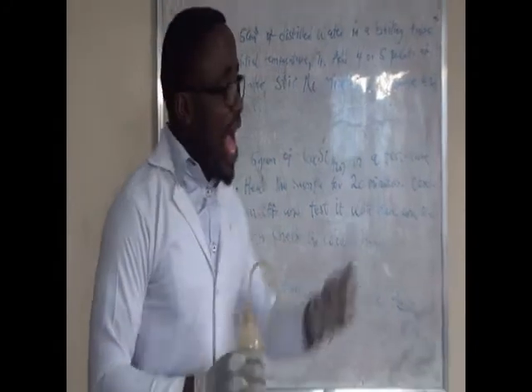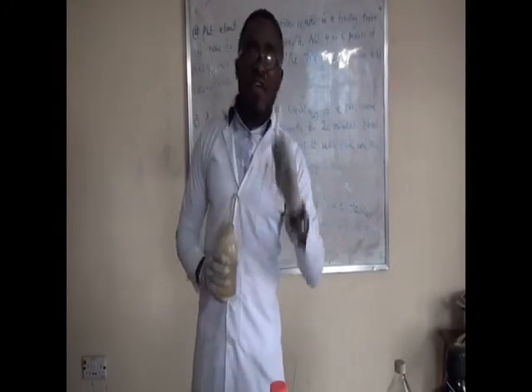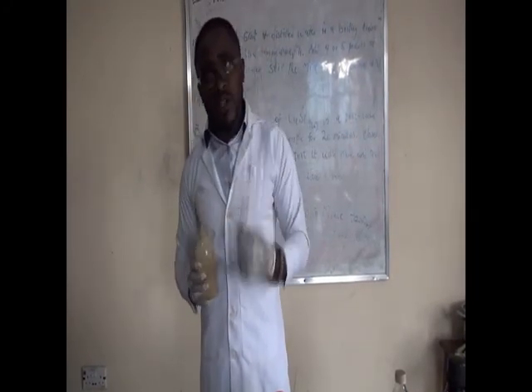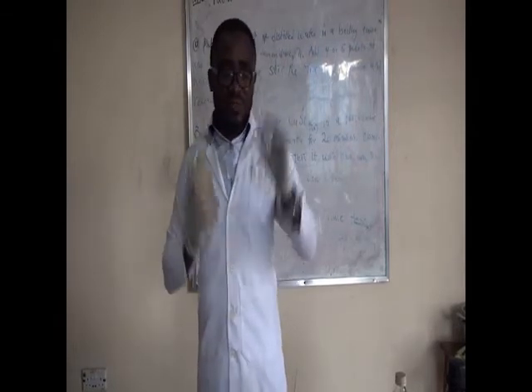Now, from that, we mean that we have our boiling tube here, and I would not like to take 5 cm³ of the volume of the water, whereas I'll just put a particular amount of the volume inside the test tube. Now, this is what we do.